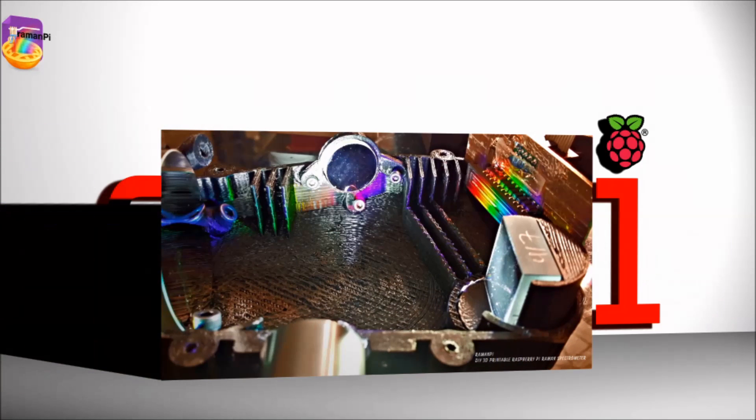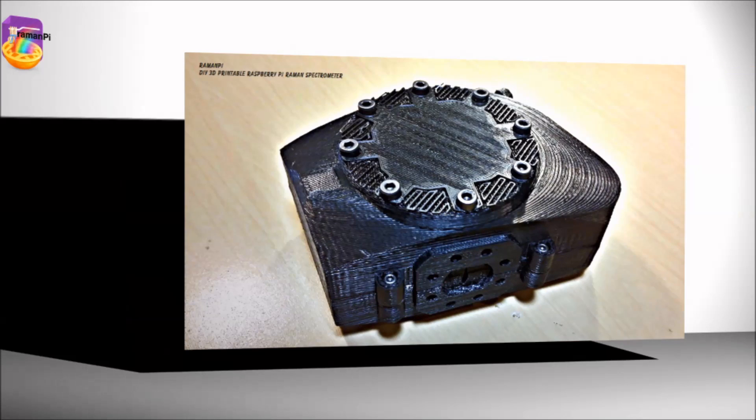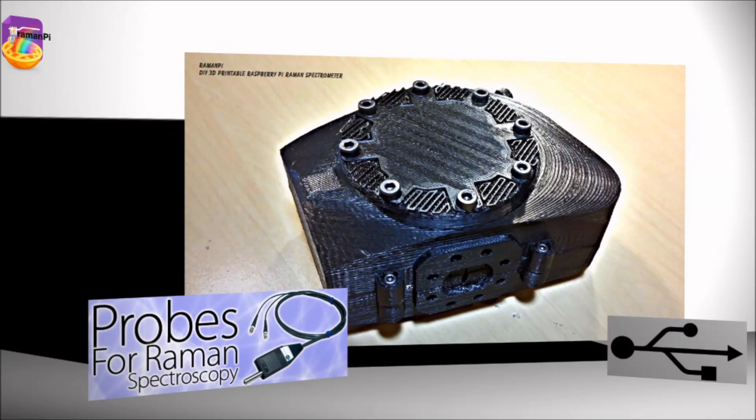The spectrometer portion can be used completely independently of the whole system. Without modification, it can be connected to a PC through USB without the rest of the system and works as a fully functional spectrometer. You can also add future adapters to the spectrometer for many additional features such as fiber optics.